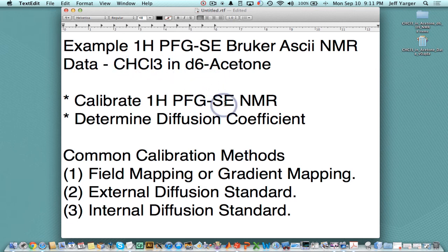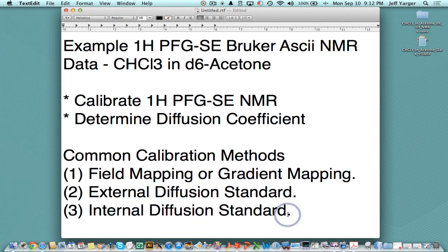We're going to quickly go through how you would calibrate that gradient and then determine the diffusion coefficient of the solute. The common calibration methods are to field map your sample, because typically your gradient from the NMR experiment is given in a percent gradient or a DAC unit on Varian — not an absolute gradient — so you need to convert it to tesla per meter. In our case, we're going to use the internal diffusion standard, the known diffusion coefficient for acetone, to calibrate our gradient, and then use that calibrated gradient to determine the diffusion coefficient of the solute, in this case chloroform.